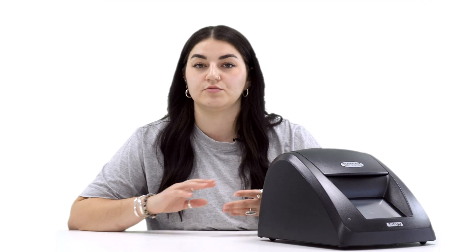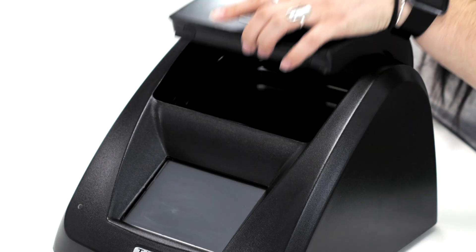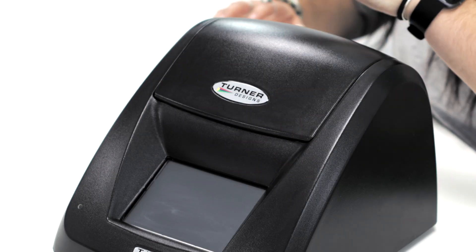Separate optical modules can be purchased for each parameter you want to measure. They are all supplied with their own excitation and emission wavelengths, and these are snap-in modules that you simply pop inside the Trilogy.